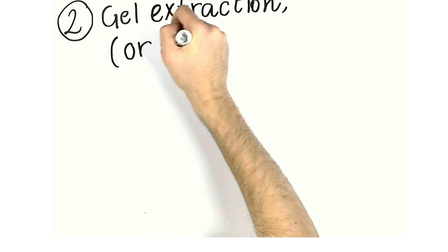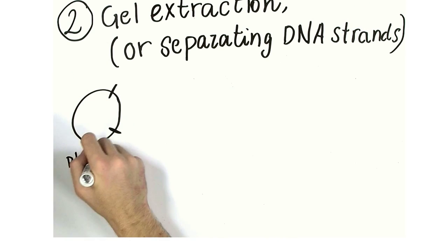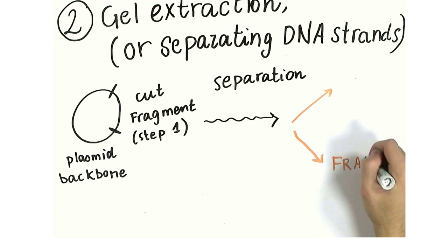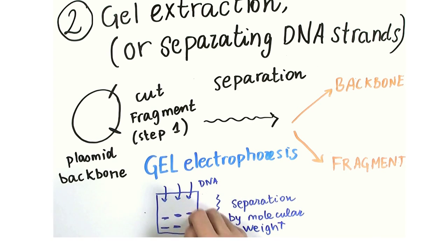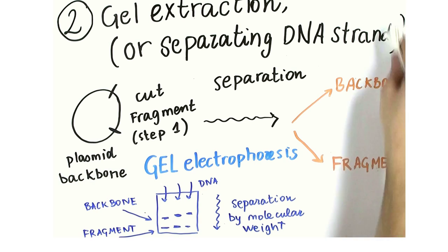2. Gel extraction, or separating DNA strands. Before you can glue a strand of DNA into another plasmid backbone, you need to first separate your gene that you cut out from your original plasmid backbone. You can do this by using a technique called gel electrophoresis. In this technique, you use agarose gel to separate DNA based on its size.